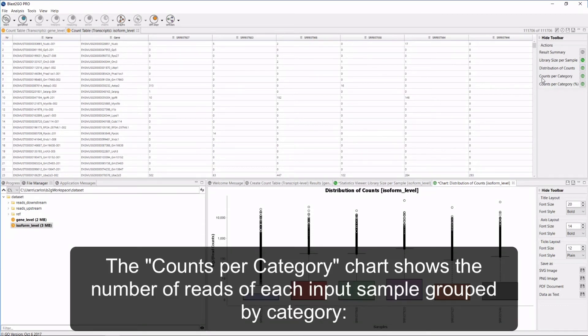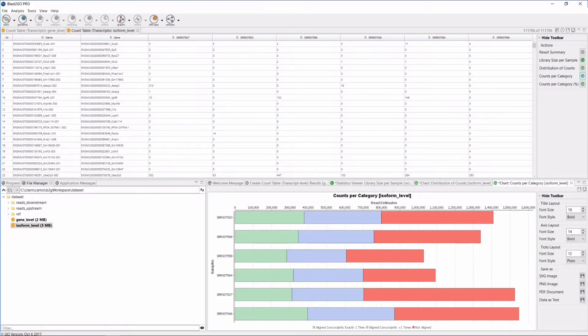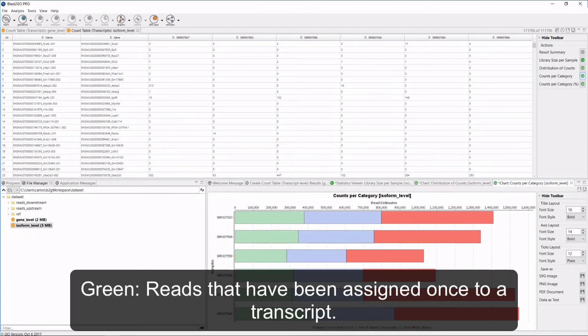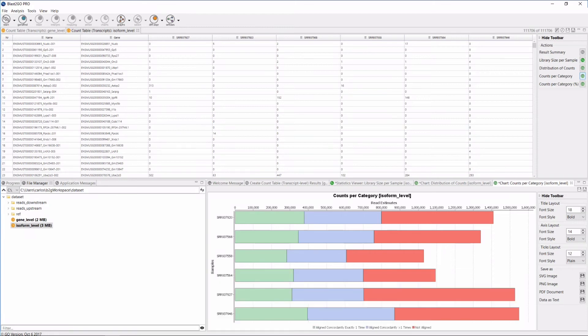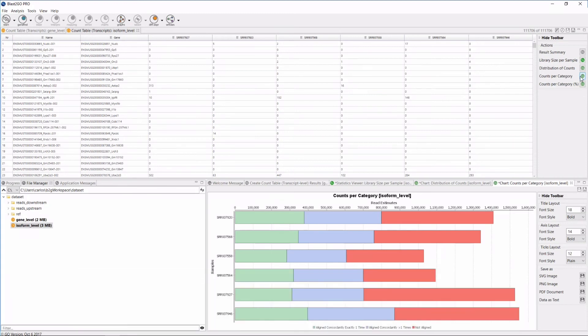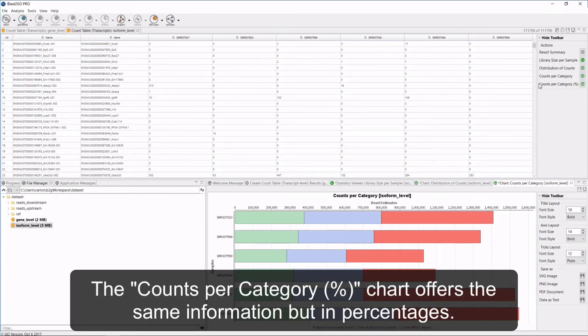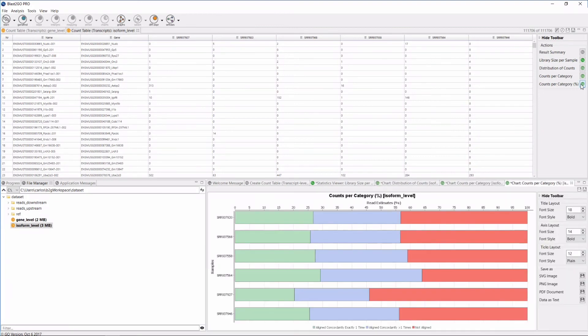The counts per category chart shows the number of reads in each input sample grouped by category. These categories include: green indicates reads that have been assigned once to a transcript, blue indicates reads assigned to more than one transcript, and red indicates reads that have not been assigned to any transcript. The counts per category percentage chart offers the same information but in percentages.